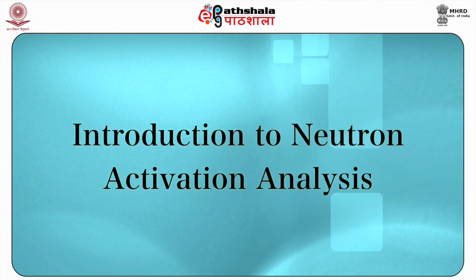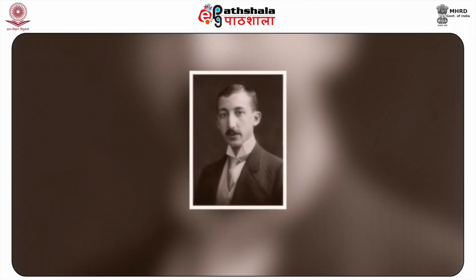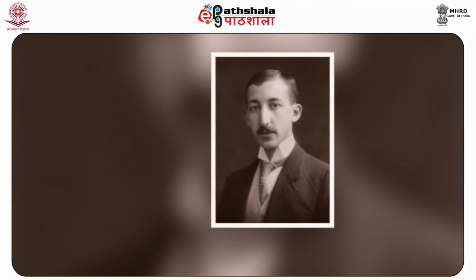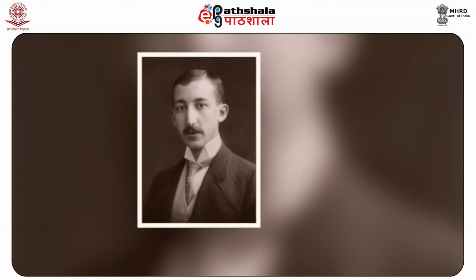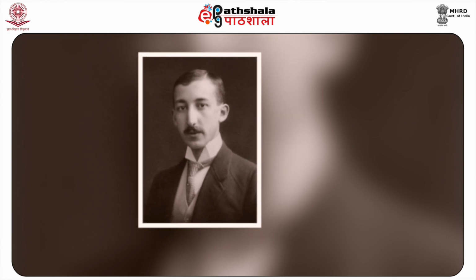Introduction to neutron activation analysis. Neutron activation is a general term for irradiating material with neutrons to create radionuclides. Neutron activation analysis was discovered in 1936 when Hevesy and Levi discovered that samples containing certain rare earth elements became highly radioactive after exposure to a source of neutrons.